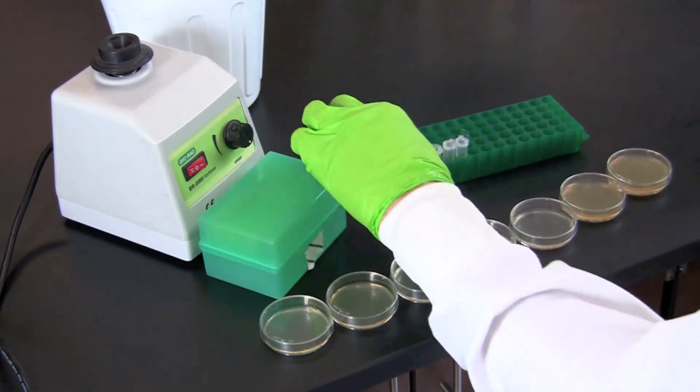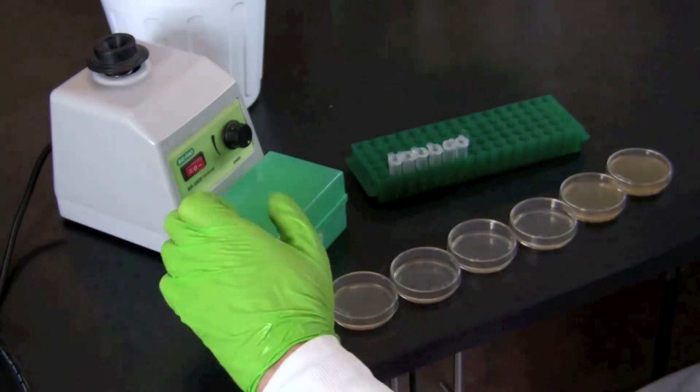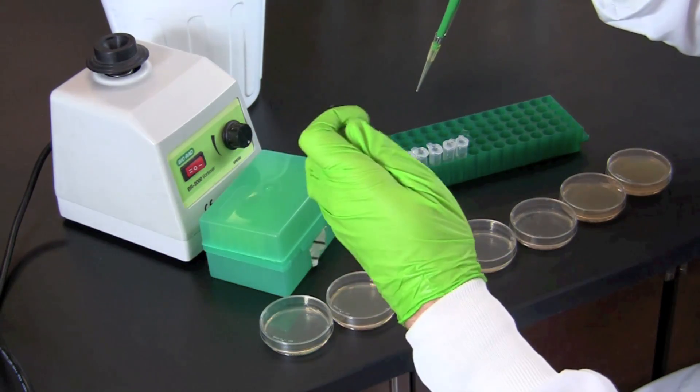Mix the diluted cell culture in the tube labeled 10 to the 1st and using aseptic technique, pipette 100 microliters onto the LB agar plate labeled 10 to the 1st.